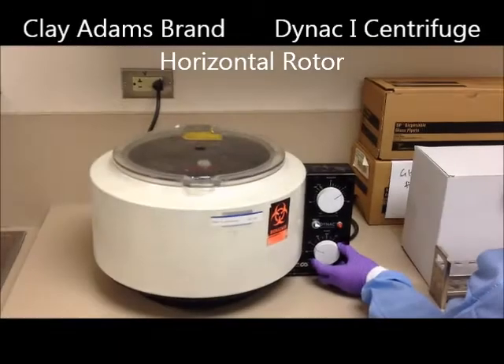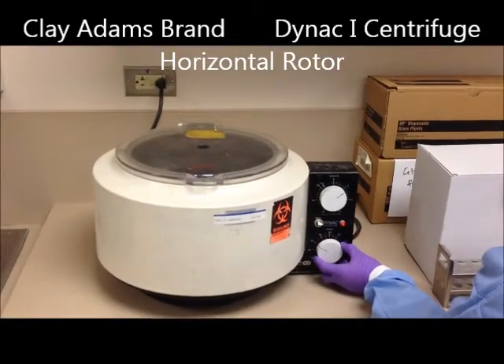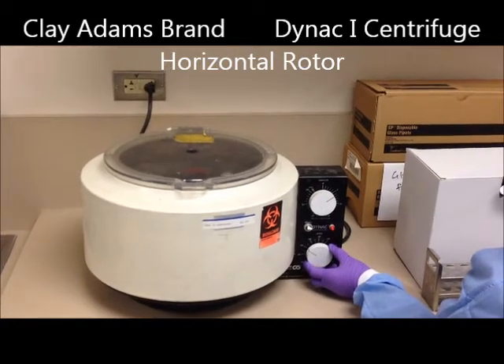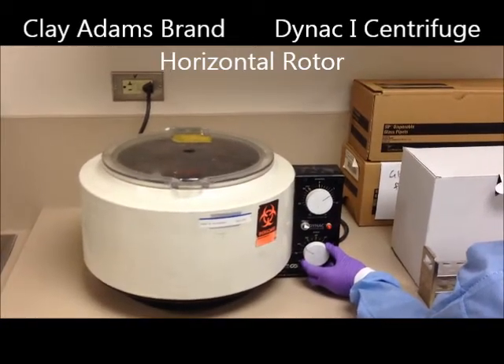Today we're going over how to safely operate a centrifuge in the laboratory. We are using a Clay Adams brand Dynac I centrifuge with a horizontal rotor. This is an older model that controls the time and speed with dials and it has a toggle switch that is used for the brake function.